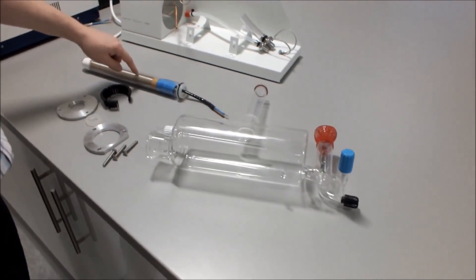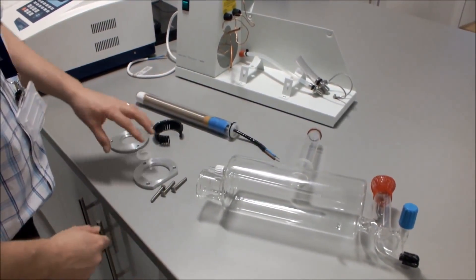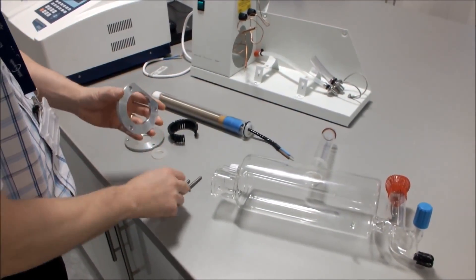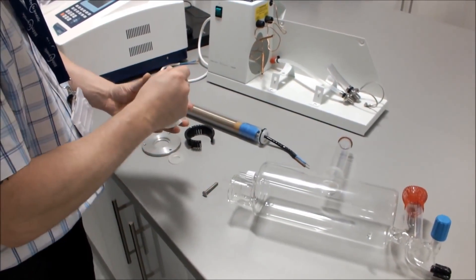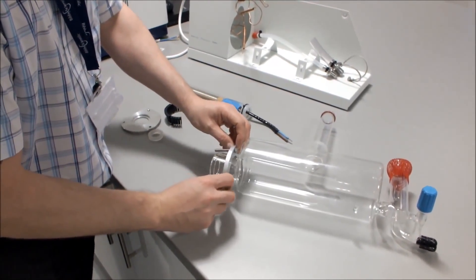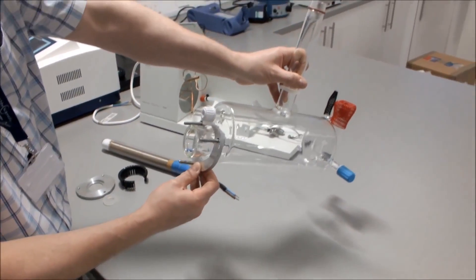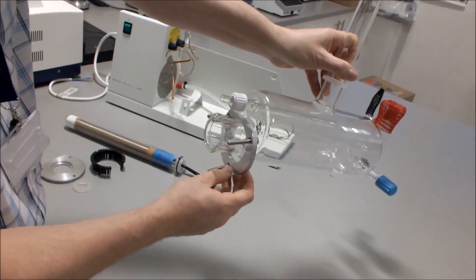That will then give you access to the thermostats underneath. We're now going to connect our heater inside our boiler. We take the flange from the gasket kit, put the three screws through the flange, and place the flange onto the opening of the boiler. Notice how the flat of the flange is fitted underneath the boiler thermostat tube.